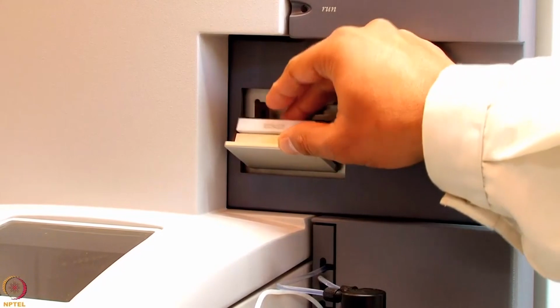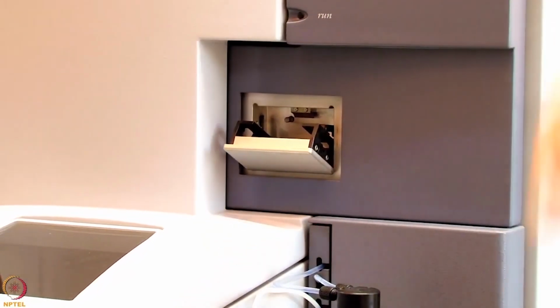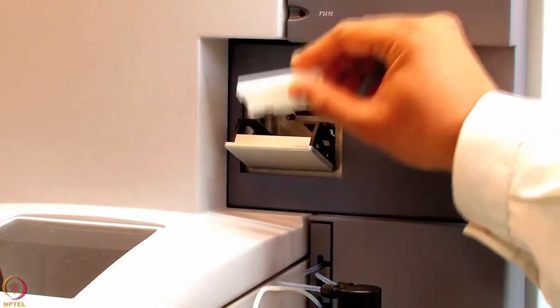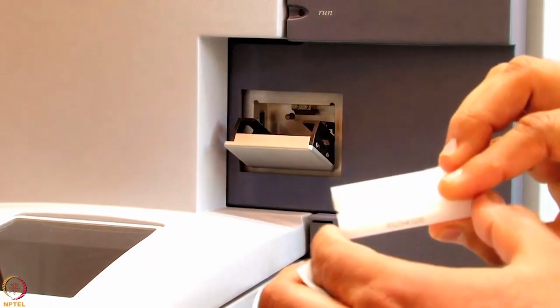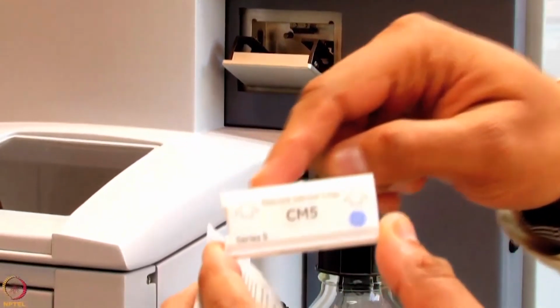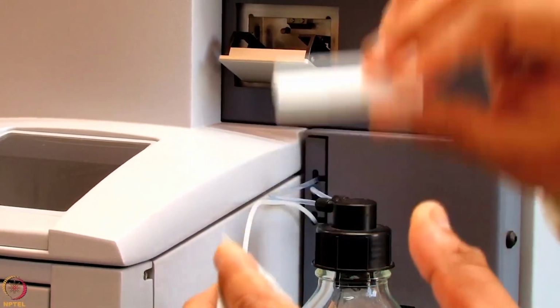So now the old chip will be removed and we will insert a new Biacore chip CM5 here, and the insertions or the way orientation of the chip is shown on the chip in arrows.